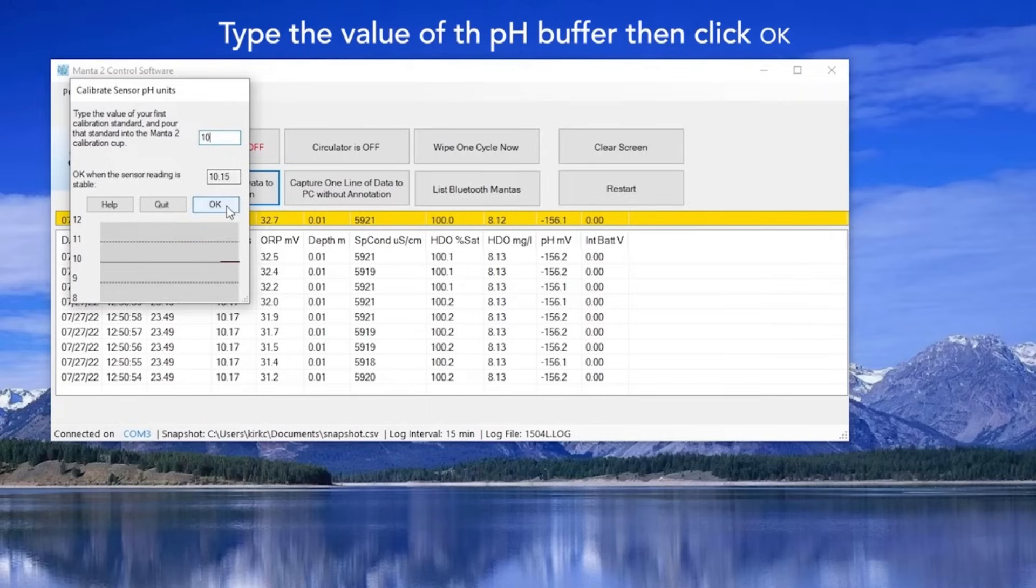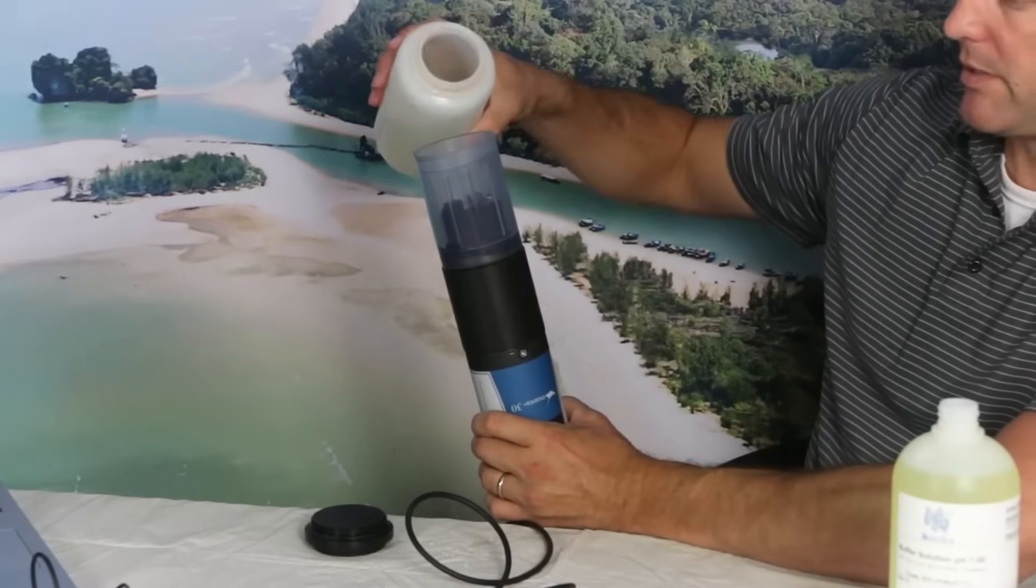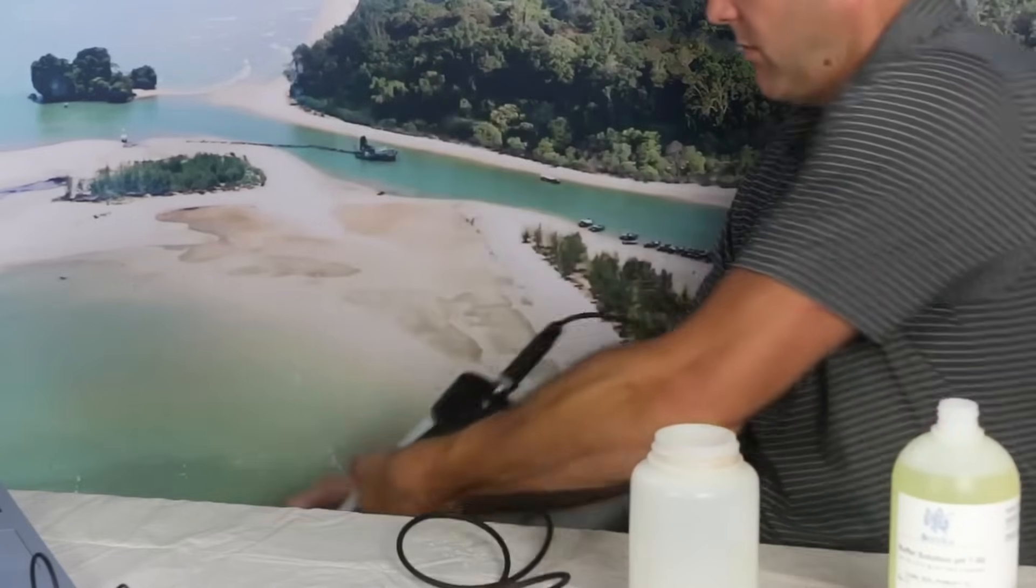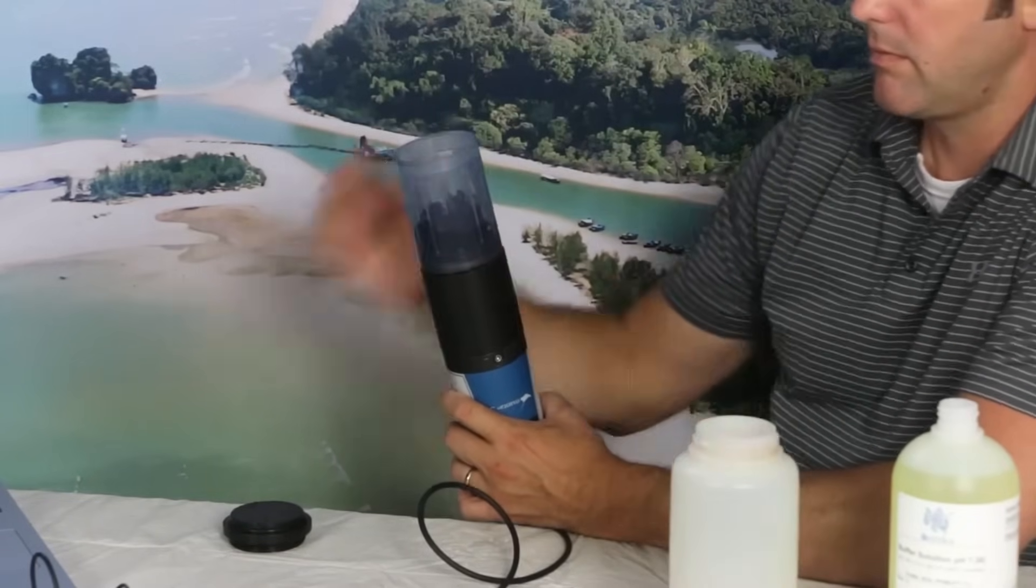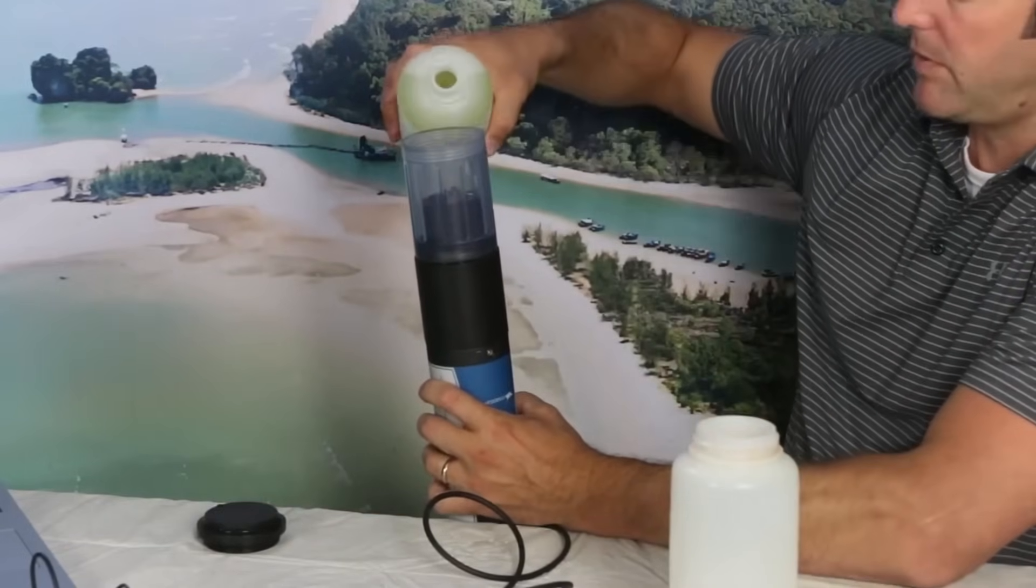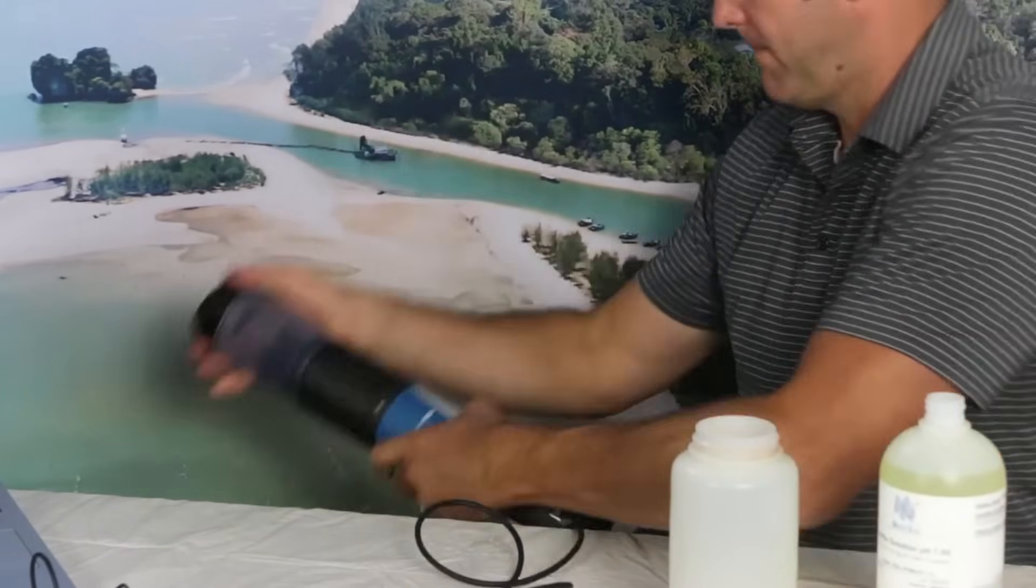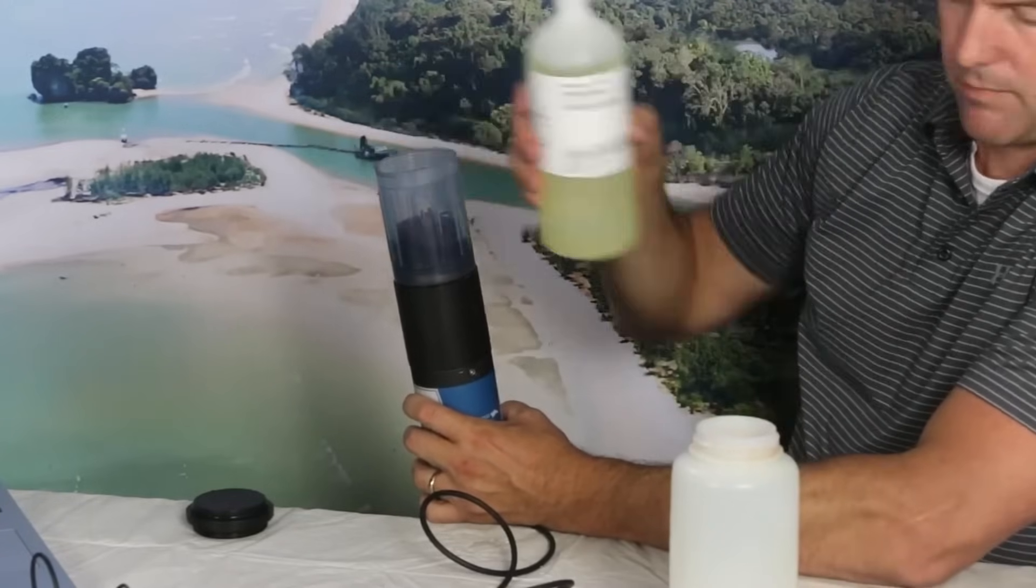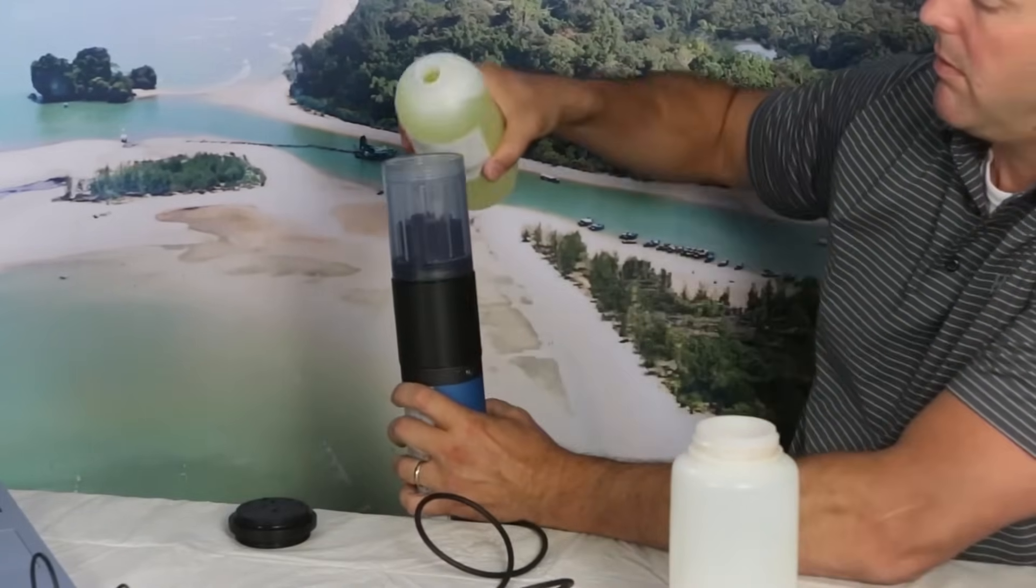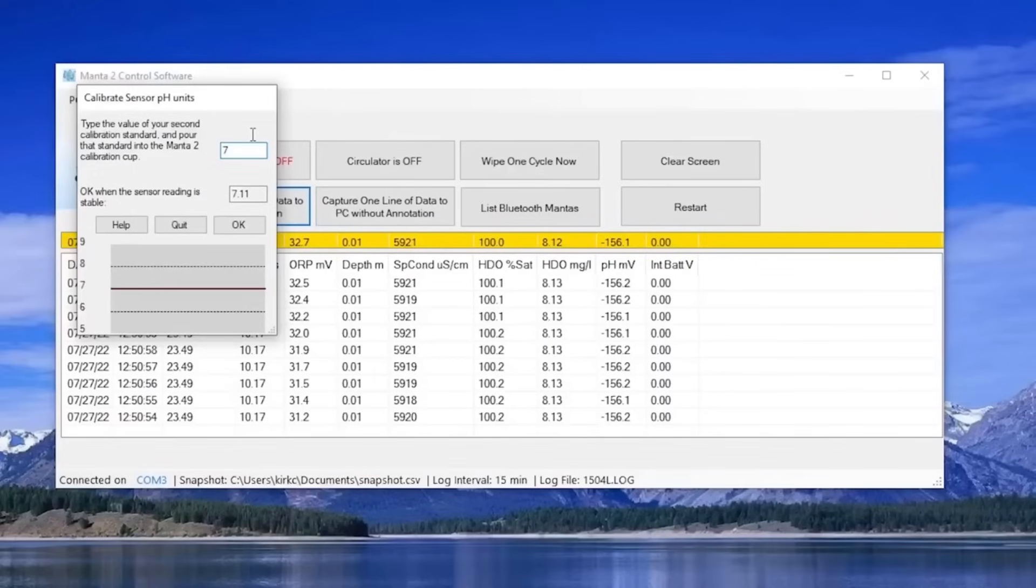You will then be prompted to do your second calibration. To calibrate your second point, we're going to do our rinsing process once again with our DI or RO water. Second rinse with water, then two rinses with our seven buffer. Then finally, fill the cup up to where all of your sensors are submerged. Wait for the reading to stabilize, and then click OK.